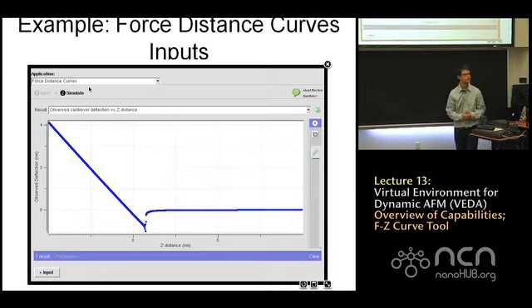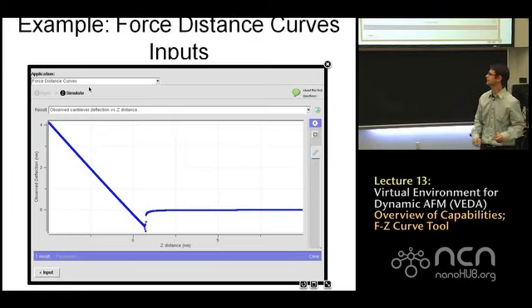The model captures that, yes, and that's my next point. We are simulating a full differential equation. It's not just a spring, so it's going to allow the cantilever to vibrate and snap into the sample. And that's what we see.